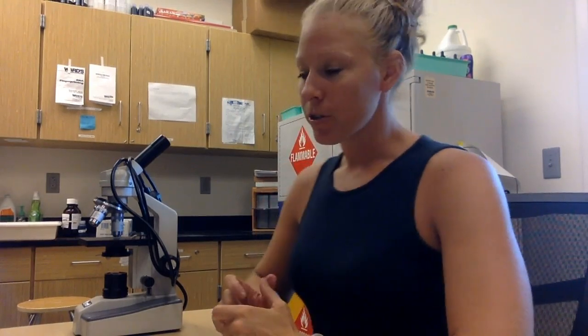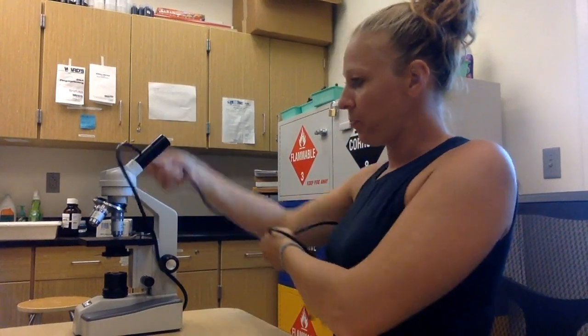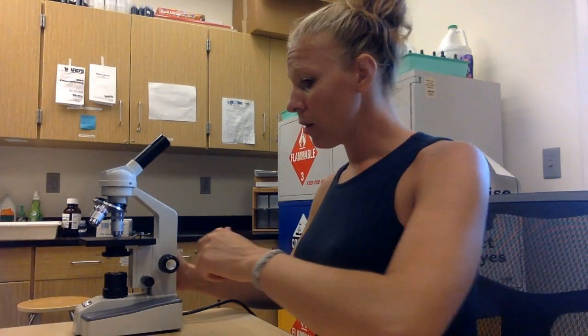We're here with the second video in our microscope series on how to use a microscope. First we're going to start with the cord — we talked about this in the last video. We're going to unwrap it, plug it in, and then turn it on. If it doesn't turn on, check the switches on the table; it might be a short circuit. When we carry the microscope, we always carry it with two hands on the arm and the base.